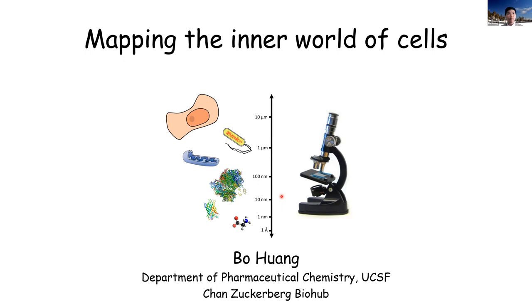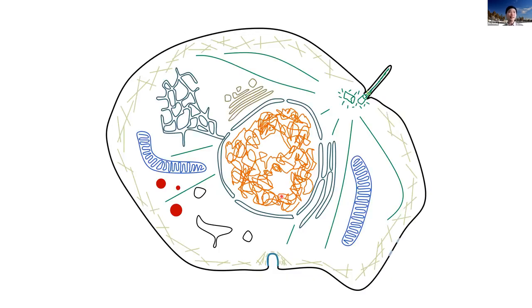For us, my lab has been, well, from the title, focused on one thing, the microscope, because of our interest in understanding how things are going on inside a cell in a tiny volume, how things are organized, how things are running around doing their jobs. With a microscope, our hope is to see what's inside a cell. Forgive me for my bad art taste. This is my hand drawing of a map of the different things in the cell.